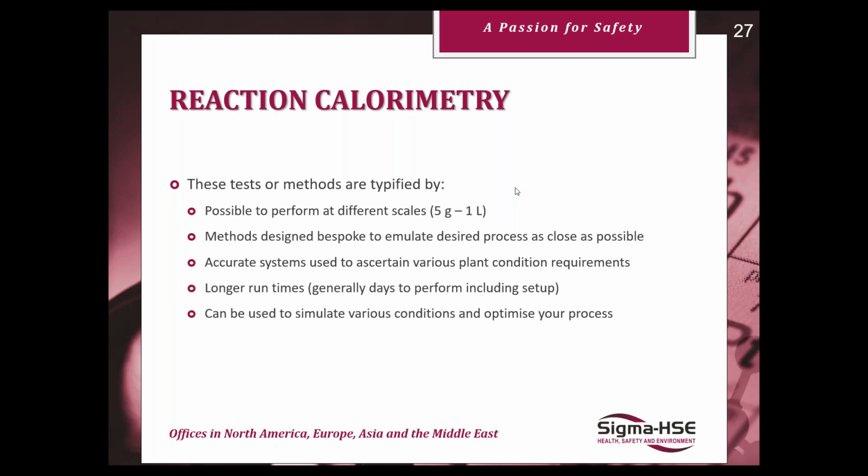As we've outlined before, the potential for a thermal runaway is typically triggered by something going wrong with the normal desired reaction, which is where our reaction calorimetry comes in, then triggering a secondary decomposition, which is where our thermal stability testing comes in.